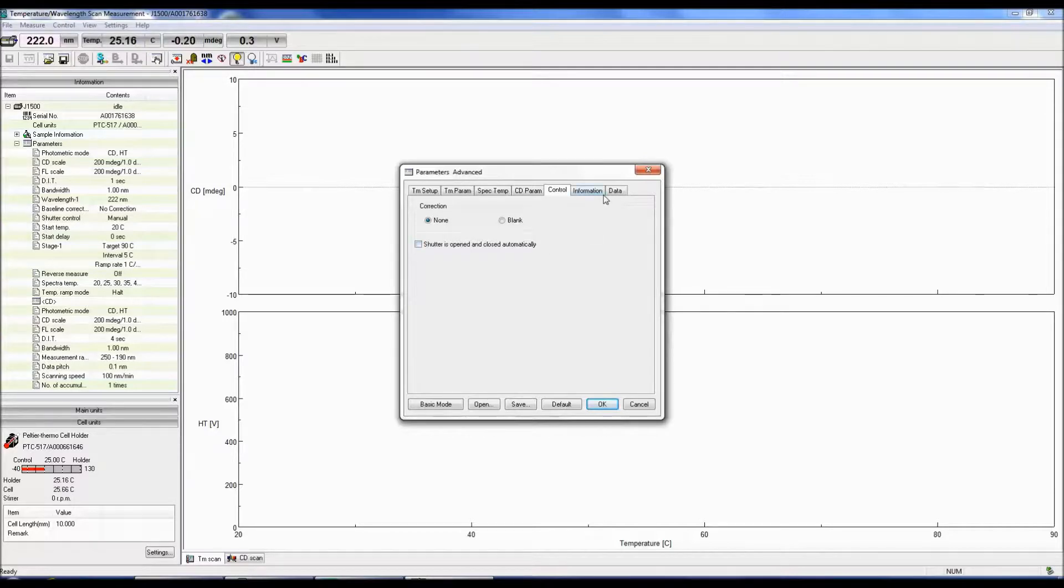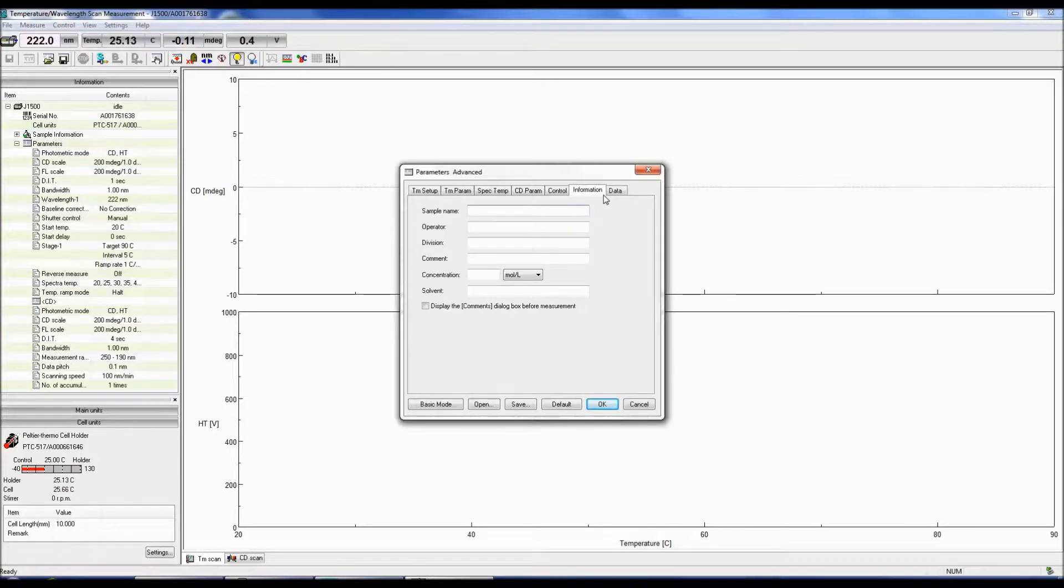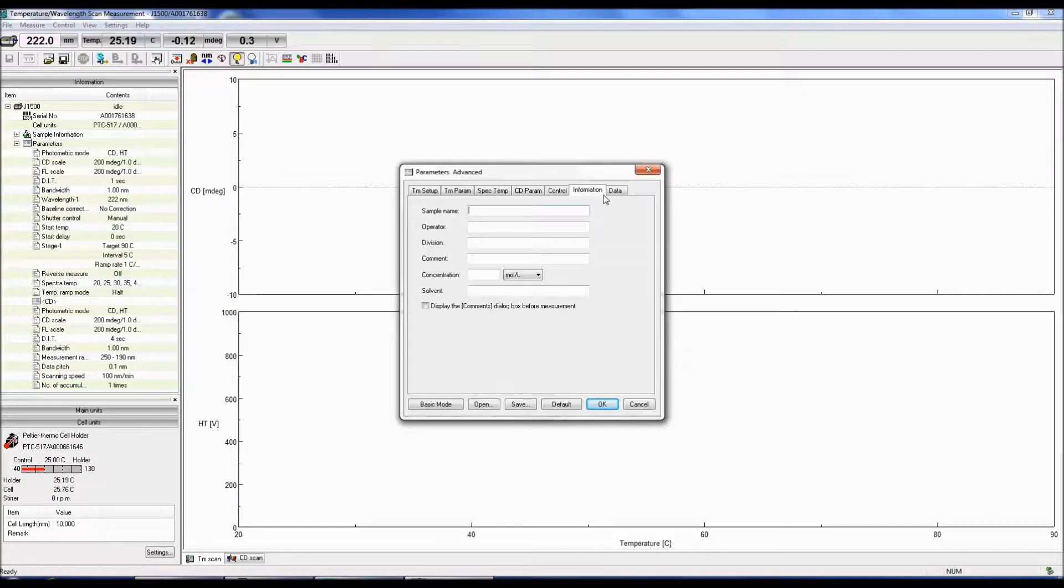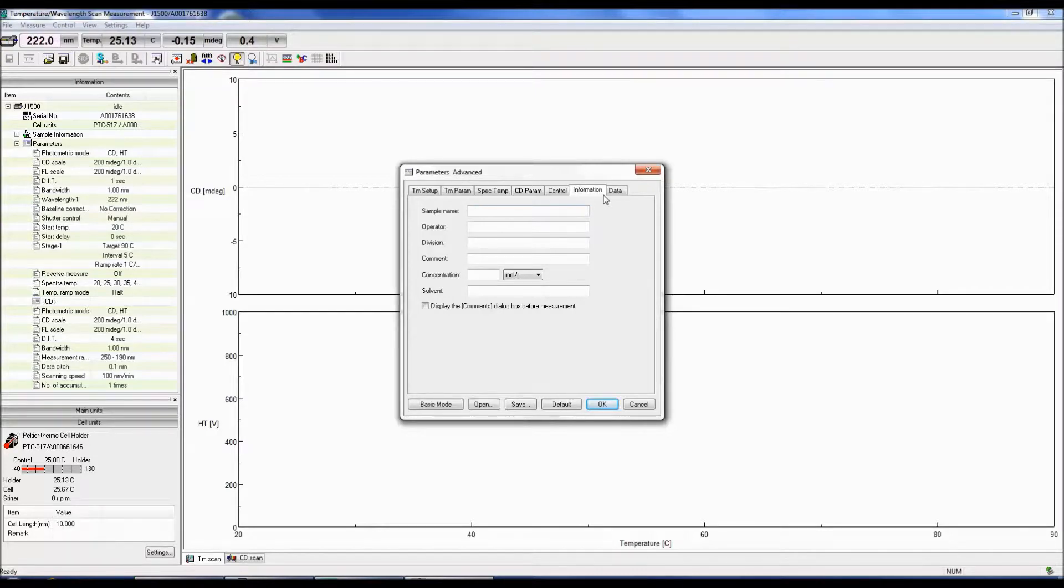The Information tab allows you to populate the desired fields such as sample name, concentration, and solvent. These comments can also be displayed in the Comments dialog box before the sample measurement. All information provided here can be later viewed in the Information tab in Spectra Analysis for each spectrum.